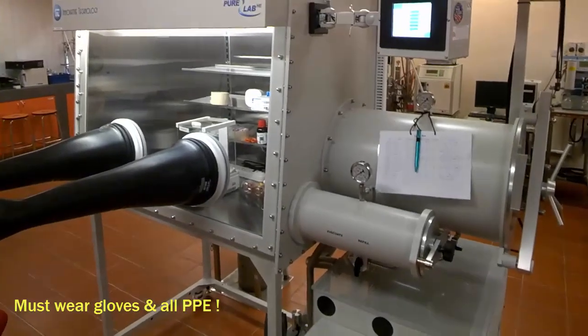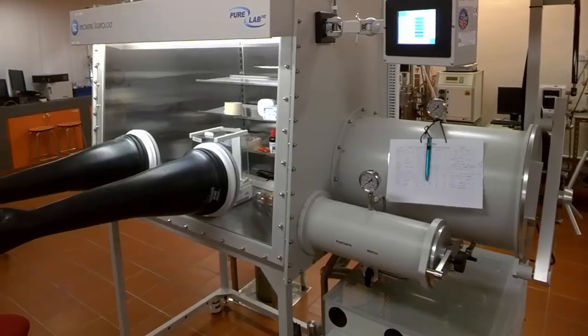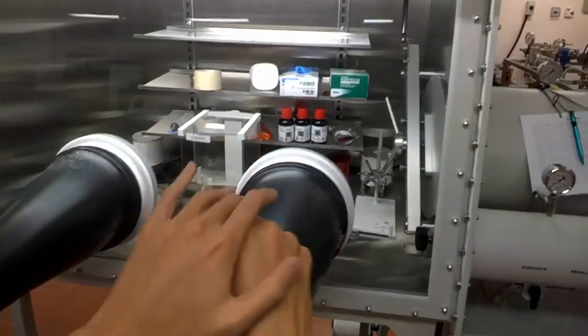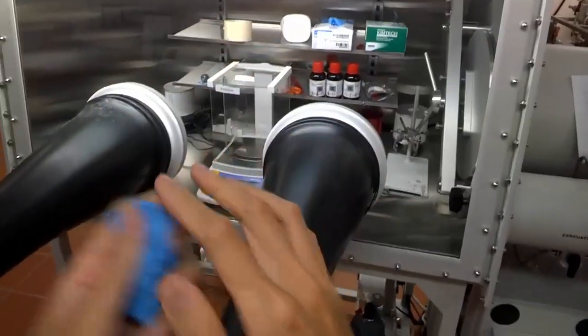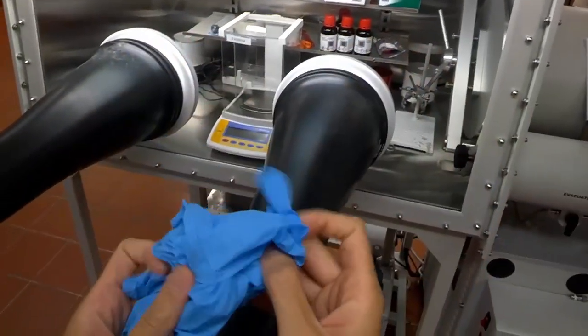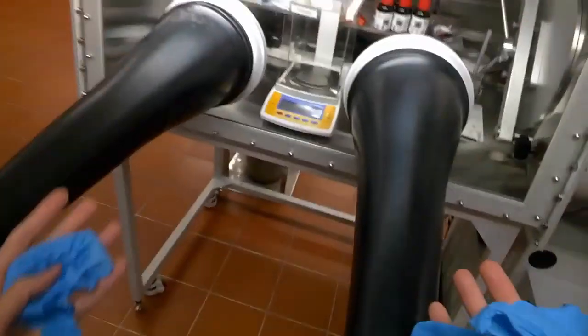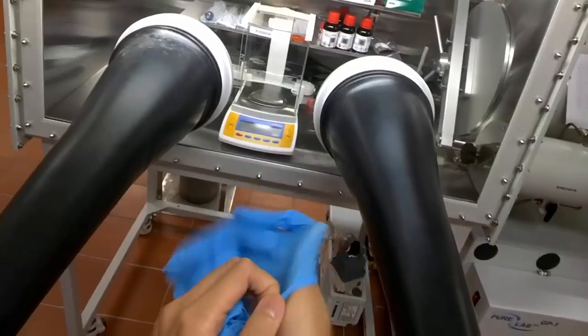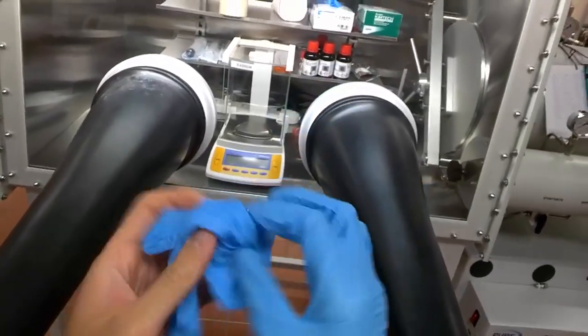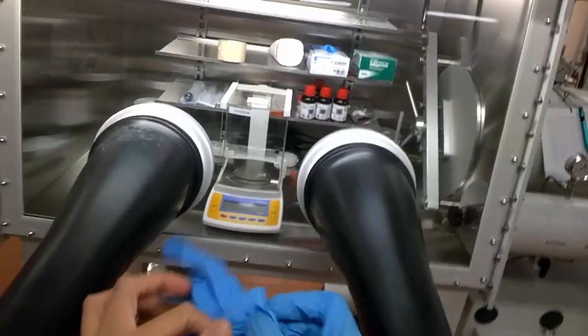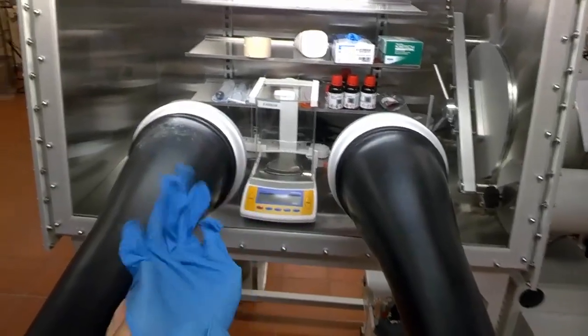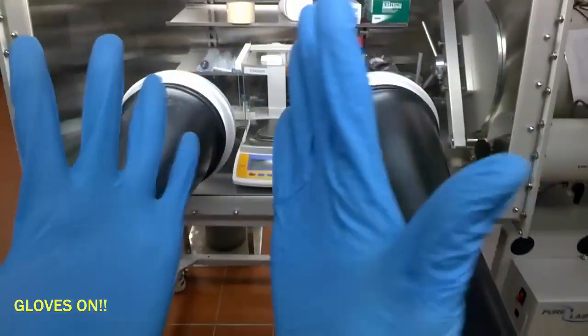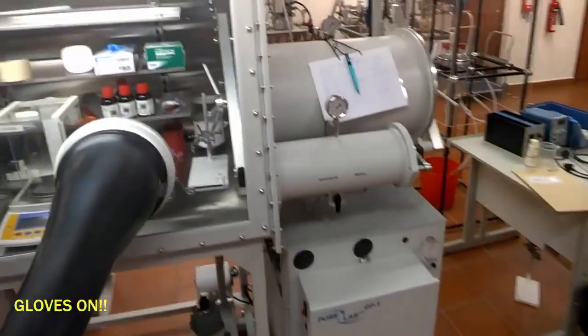Before you start, ensure that your hands are clean and you are wearing a pair of gloves. You cannot just put your naked hands inside the box gloves because there may be contamination due to other uses next time. So, put on a pair of gloves. Of course, PPE is a must. Your safety goggles. Lab coat. Covered shoes. Right, so now we put on the pair of gloves. So, here we go. Gloves on. And we are good to go.